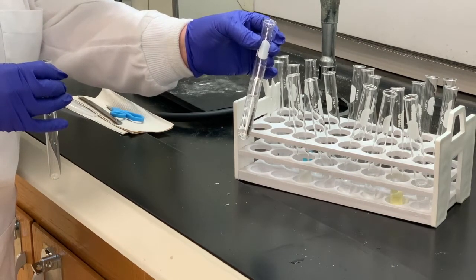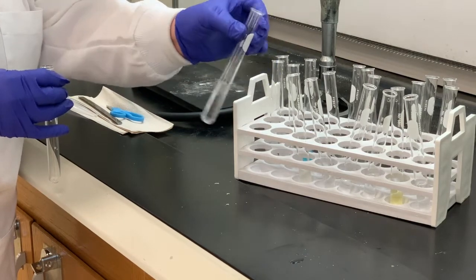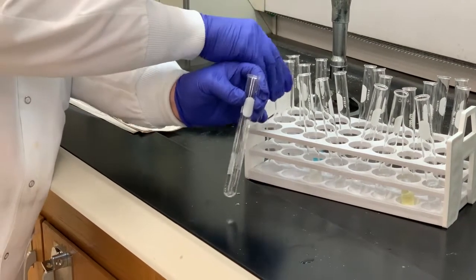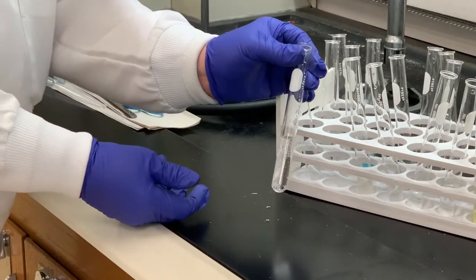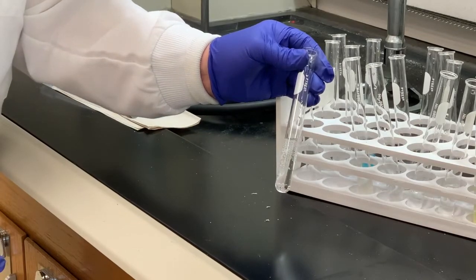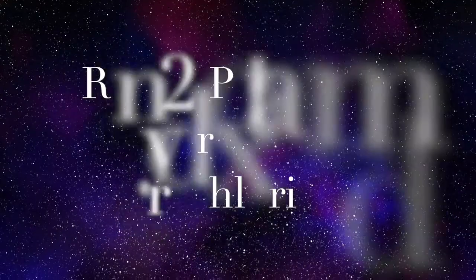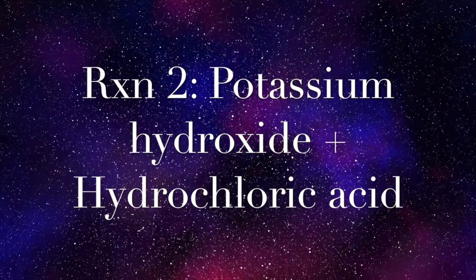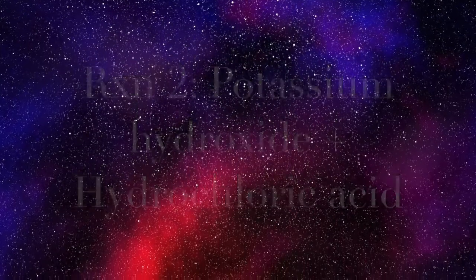And if you notice, you should have seen bubbles that formed. There's no color change. I don't notice any temperature change, but we did see the bubbles form. So did a reaction occur? We would say yes. The next set of reagents we're going to use is potassium hydroxide and hydrochloric acid.